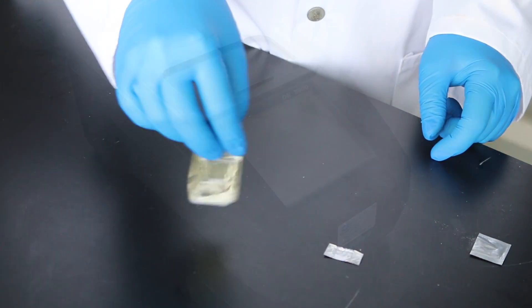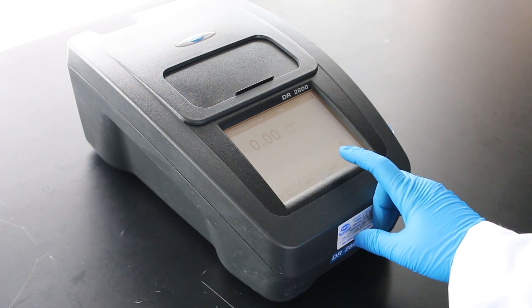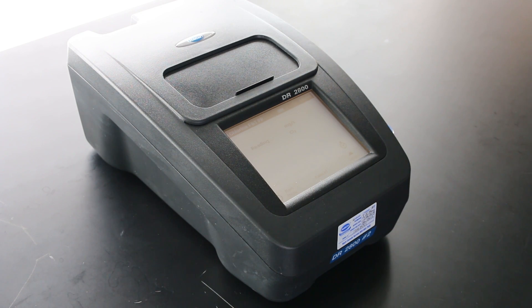If the sample is over range, it must be diluted and the test must be repeated, or another method may be available to measure the sample without dilution.